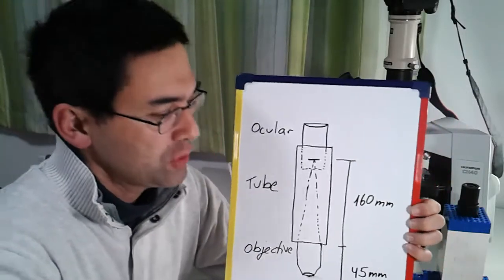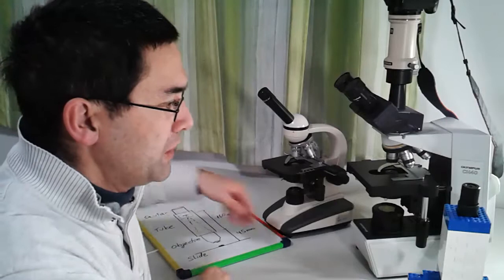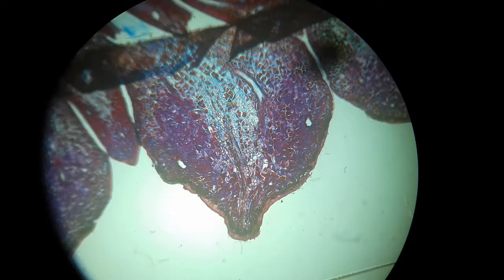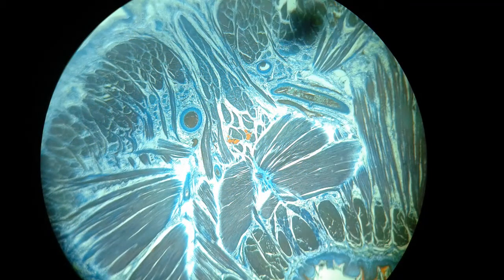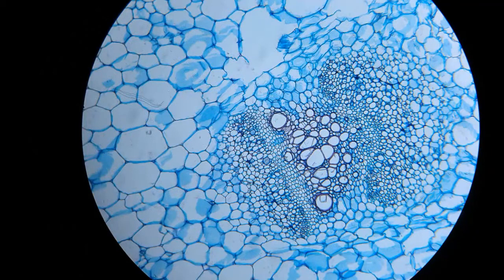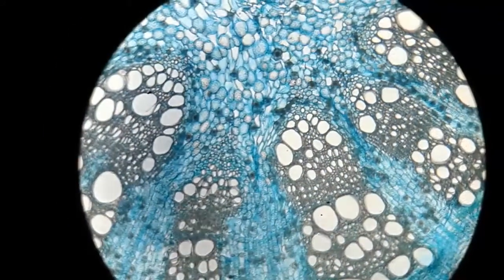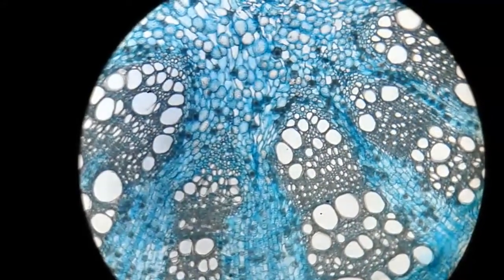I'm going to show you how this actually works by taking apart the microscope, but first, because you might not believe me that it actually works, I'm going to show you a couple of pictures first. I took the pictures with my mobile phone through the eyepiece. These pictures are under 40X total magnification, and the next pictures are taken at a total magnification of 100X. I would not go higher than 100X because then it's really difficult — almost impossible to refocus.